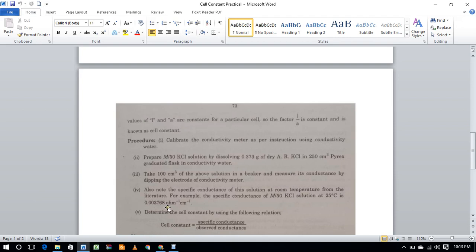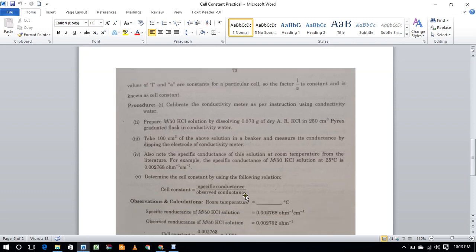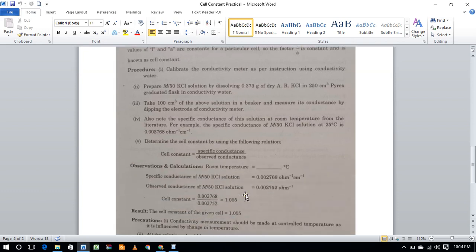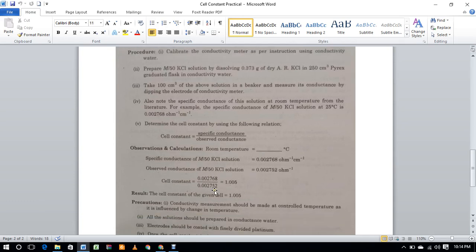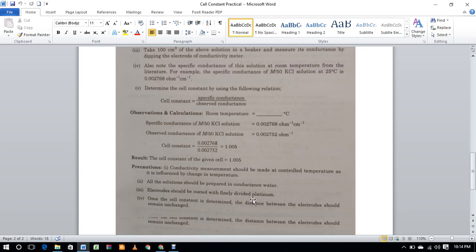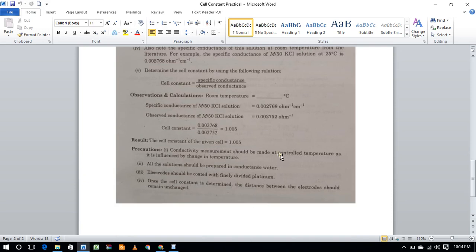The value is 0.002768 per ohm per cm. Using the formula, you can calculate the cell constant. This is a simple practical. Thank you.